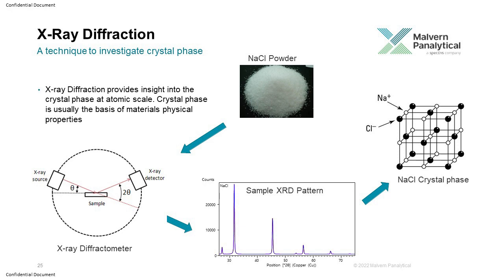Once you measure with diffraction, you get these diffraction peaks. These peaks don't represent elements, they represent a crystal phase. So whatever crystal phase you have, say NMC 811, all these peaks belong not to one peak nickel, one peak cobalt, one peak manganese, no. All these peaks belong to NMC hydroxide.